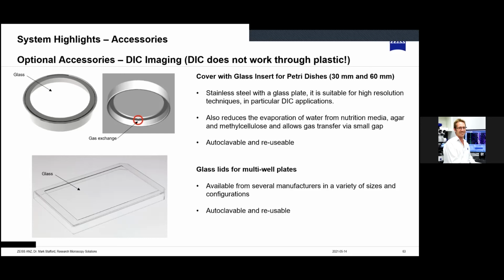Do you have these available, these kind of glass covers, or do you normally just take the cover off? Yeah, so you can take the cover off, but for people doing long-term time-lapse imaging, you're going to get evaporation if you take the cover off. So these can assist with minimizing evaporation, and they're great for DIC.